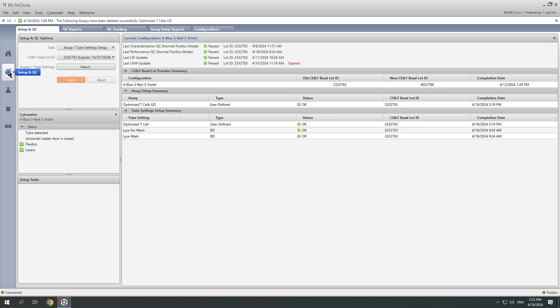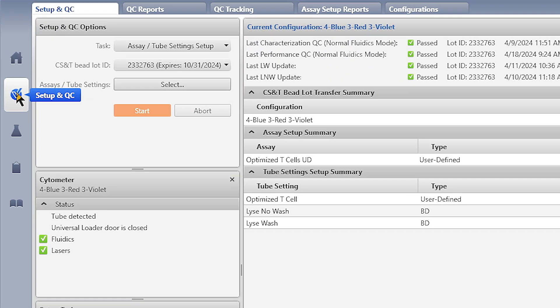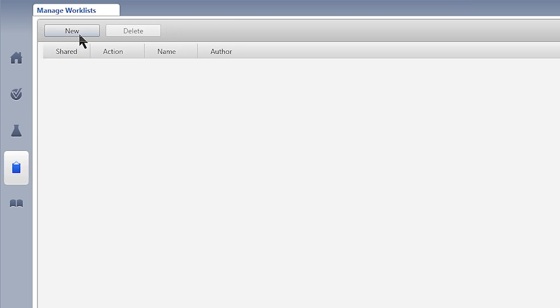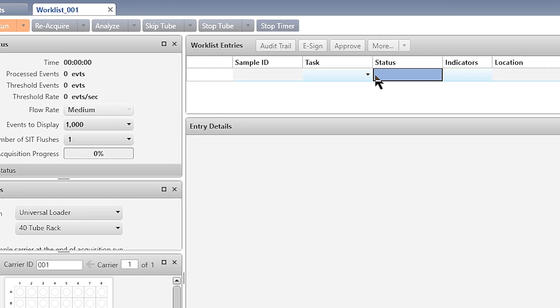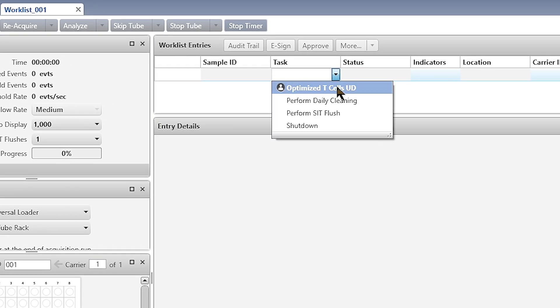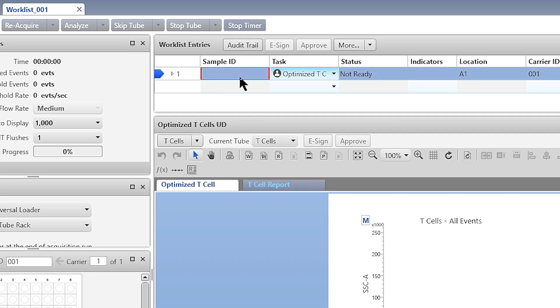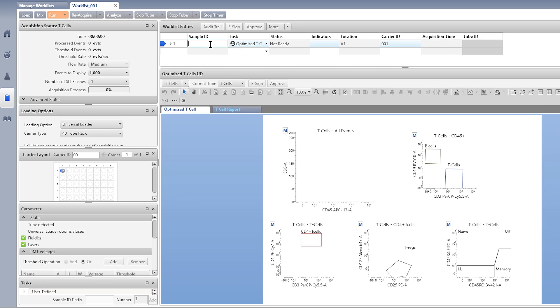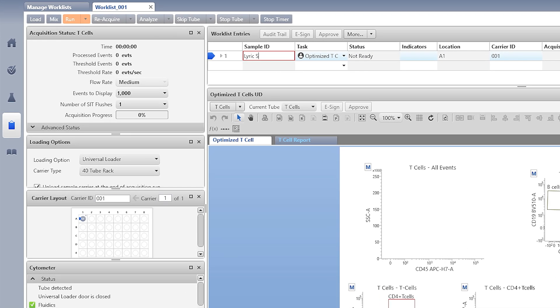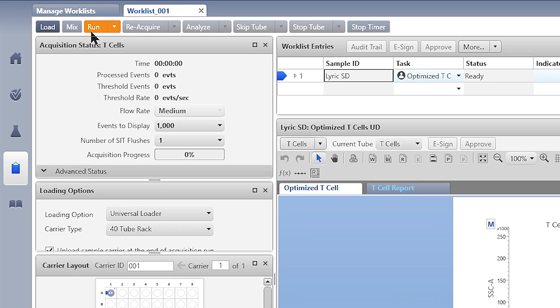Now I'm ready to run my sample. I'm going to go to the work list, select the T-cell assay, assign a sample ID, and acquire my sample.